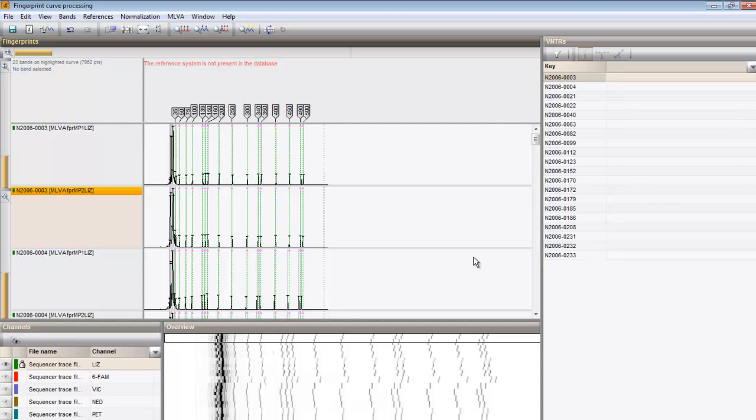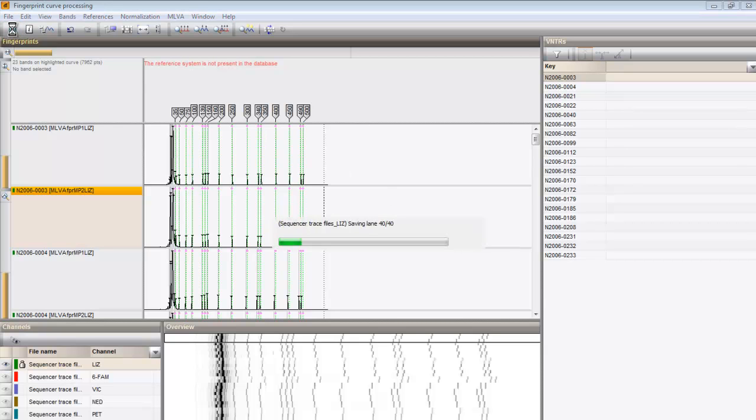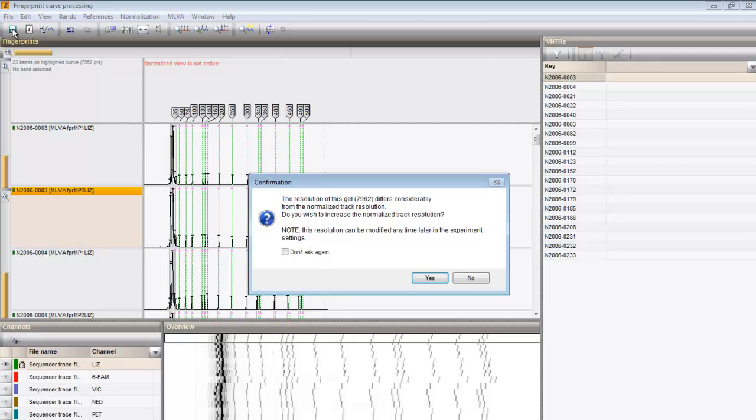For the calibration information to become available, we save the data to the database. I confirm the increased normalized track resolution.